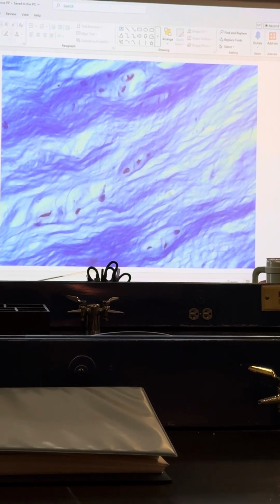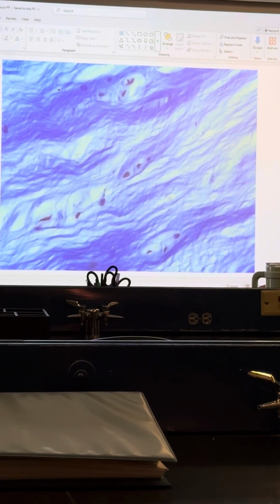So we know this is a cartilage. What type of cartilage? Fibrocartilage. Where can we find fibrocartilage? Intervertebral discs. It's in there. The menisci of the knee. That's good. Those are good places. The pubic symphysis is also fibrocartilage.